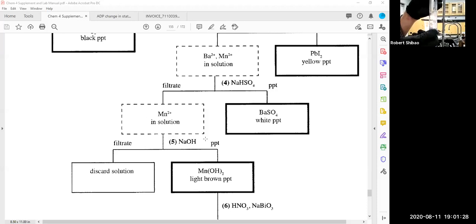This test tube was at room temperature. And so as that solution hits the cold test tube, the solubility of the lead-2 chloride goes way down, it becomes supersaturated and precipitates out. And so this is just lead-2 chloride that just precipitated. If I put this back in the hot water bath, it should dissolve again. So I'm going to put it back in there.